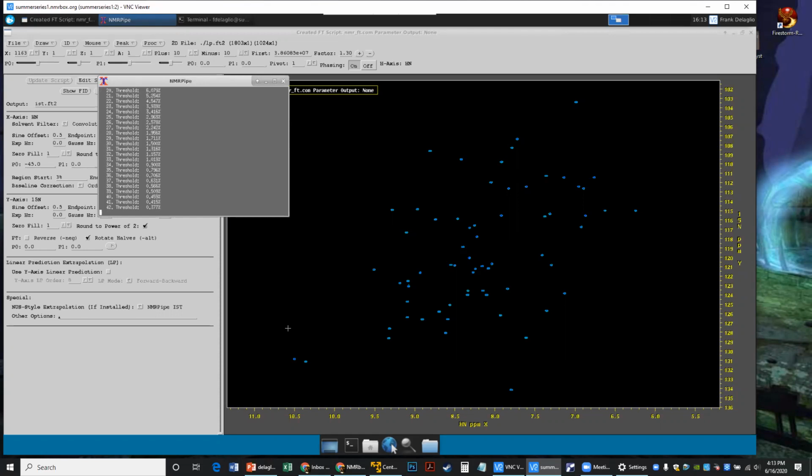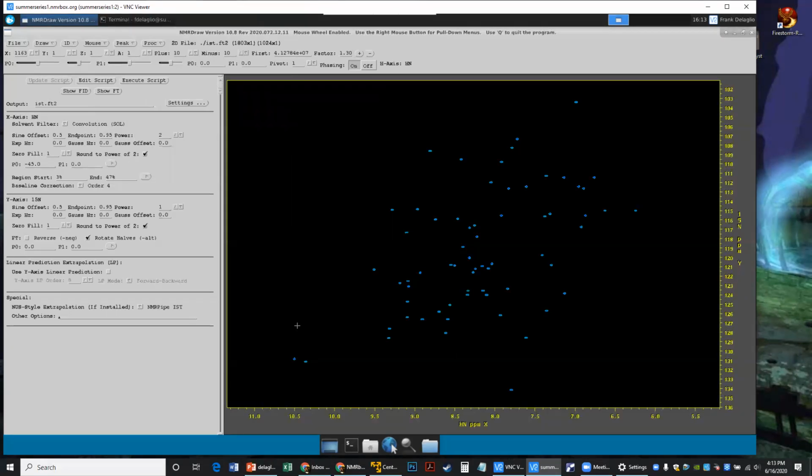Right. That's a great point. Now that you mention that, I will show something about that. Here's my question. Does yours exit there, or does it exit after the thresholding step? You have a choice. Oh, okay, excellent.